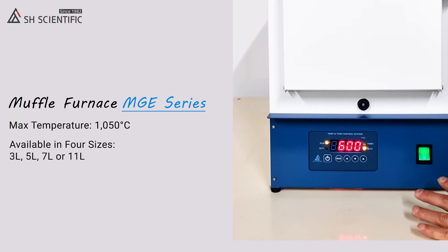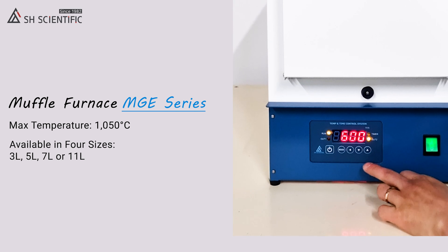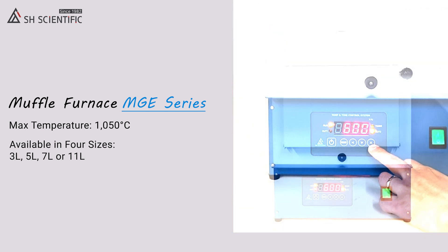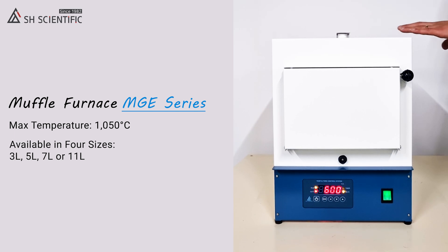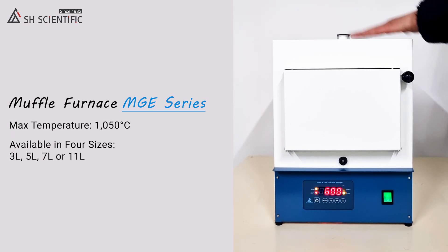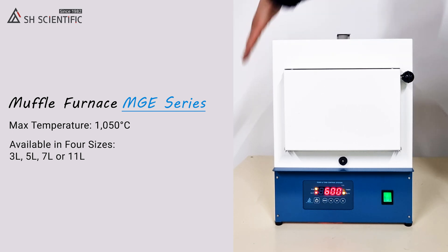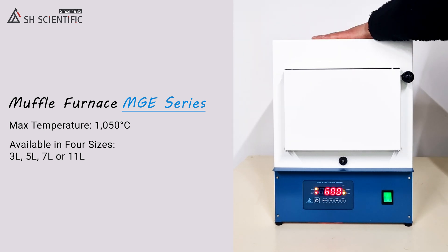Now Out 1 is blinking, which tells us it's up to temperature, and the heater is going to stay right at this level. Obviously, safety is a concern around anything this hot, but our MGE furnaces are so well insulated that they're actually safe to touch while running.